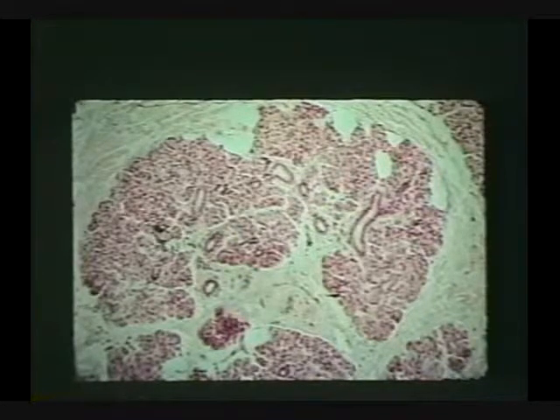And this one, you notice the gland is all what? Serous. Serous, which tells you it's what gland? Parotid. The parotid gland. And the parotid gland, its duct drains where? The back upper. The upper molars. Second upper molar. See? And these are all like serous acini, so this one is more amylase, digestive enzyme production, compared to the sublingual, which is more mucus lubrication.